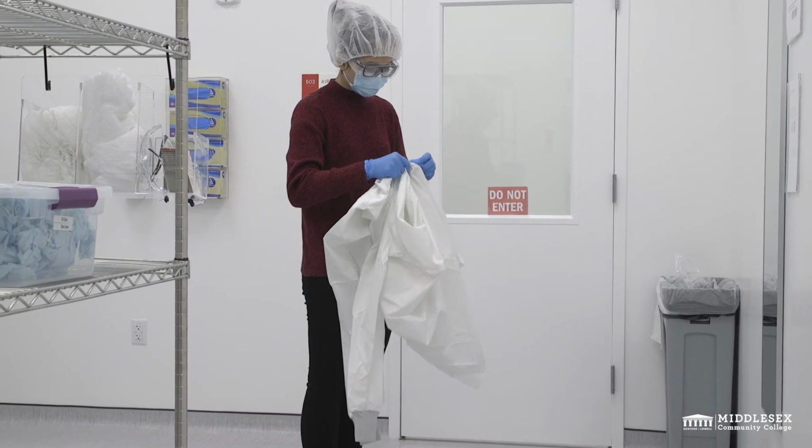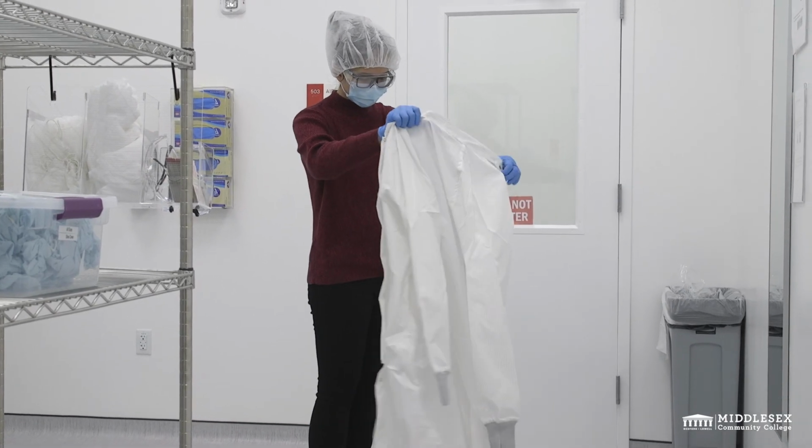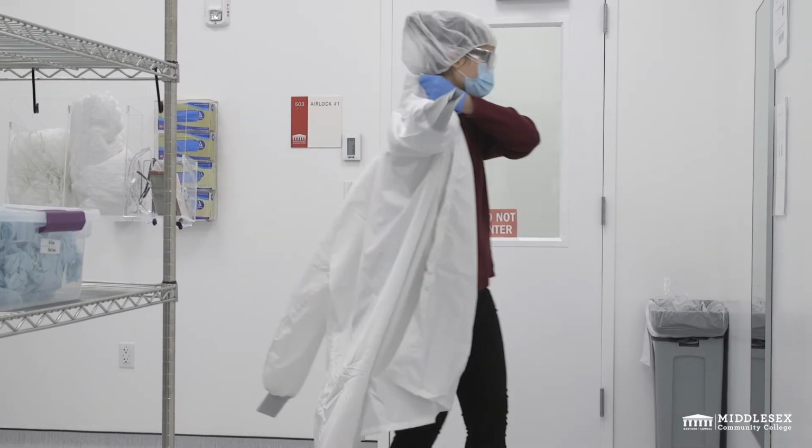You want to don your coveralls or your frock in a manner that prevents them from touching the floor or the walls to minimize contamination.